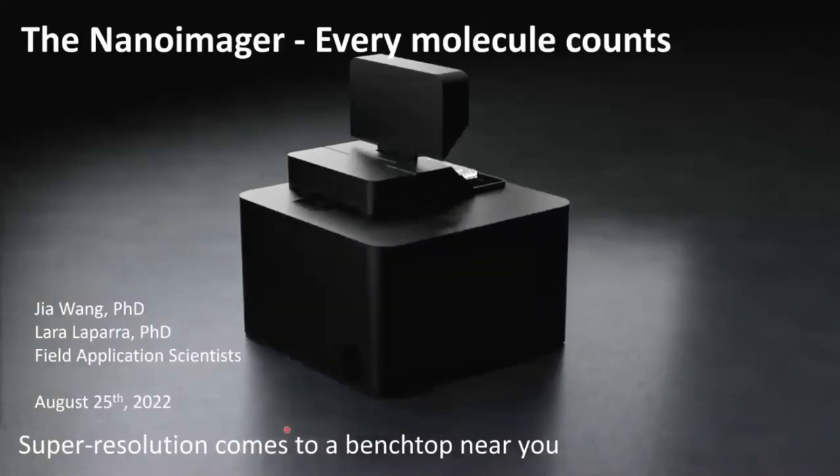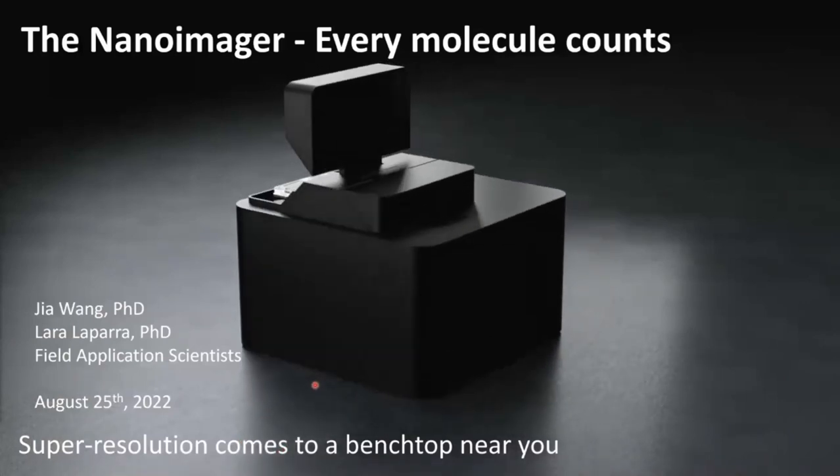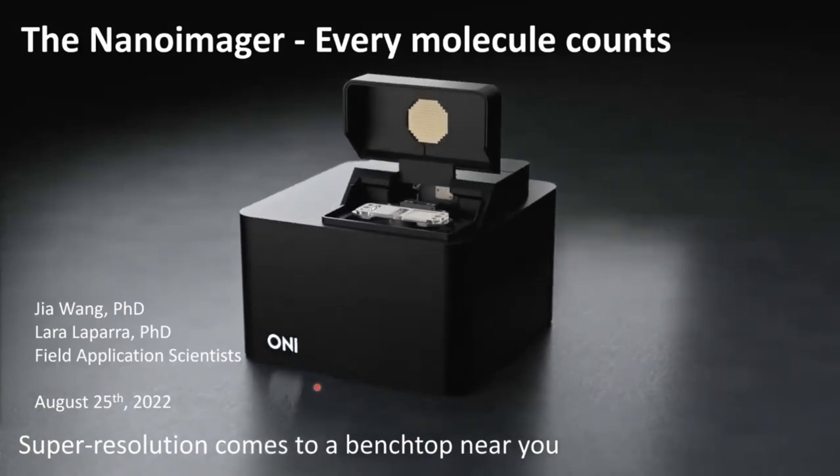Hi everyone, I'm Lara. I'm one of the field application scientists. Today I would like to talk to you about our flagship product, the Nanoimager. I'm just going to share my screen. Here we go. This is our flagship product, the Nanoimager. Today I'll be talking to you about how we can bring super resolution to a benchtop near you.